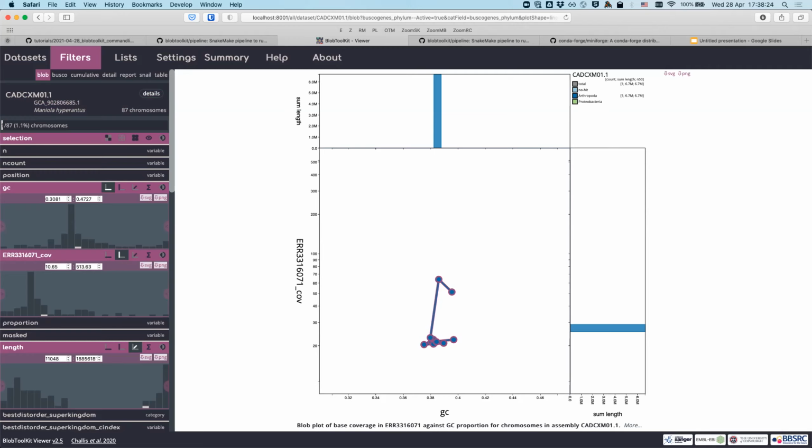Does anybody have a question? I have a quick question about it. So it just breaks it automatically into 10 pieces. If it's longer than 1 megabase, then each part is a tenth. If it's shorter than 1 megabase, it'll break it up into chunks of 100 kb. Okay, so you'll get a maximum of 10 pieces. Yeah. And if it's shorter than 100 kb, it'll only give you 1.